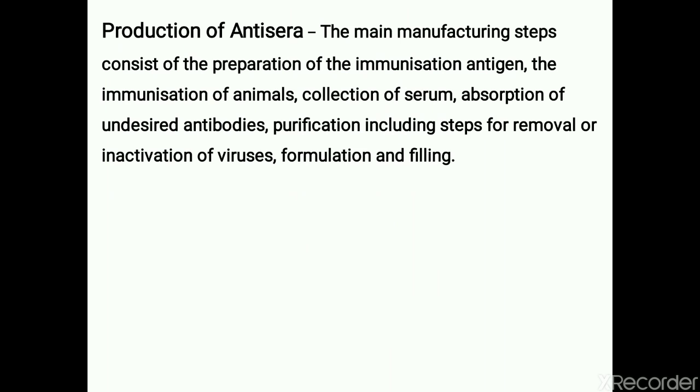The method of production of antisera. These manufacturing steps are divided into several categories. The first step is preparation of the immunization antigen. Second is immunization of animals, collection of serum, adsorption of undesirable antibodies, purification, including the steps for removal or inactivation of viruses, formulation, and finally filling.